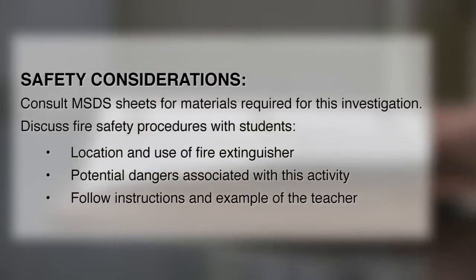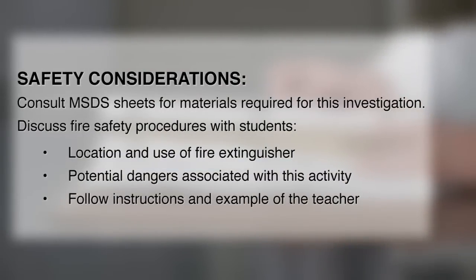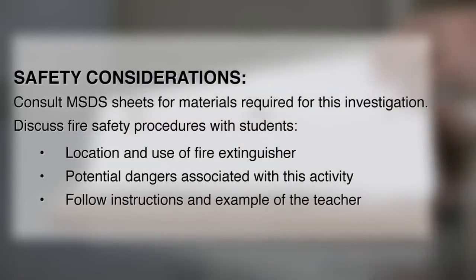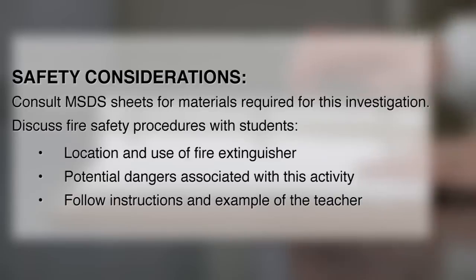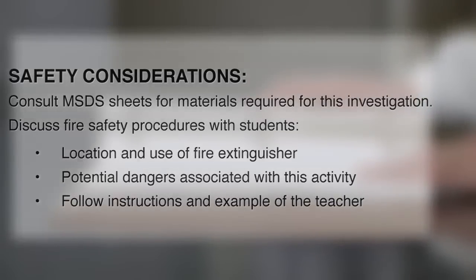Prior to beginning the investigation, teachers are reminded to discuss fire safety procedures with their students, including the location and use of the fire extinguisher, any potential dangers associated with this activity, and the need to carefully follow the instructions and example of the teacher.